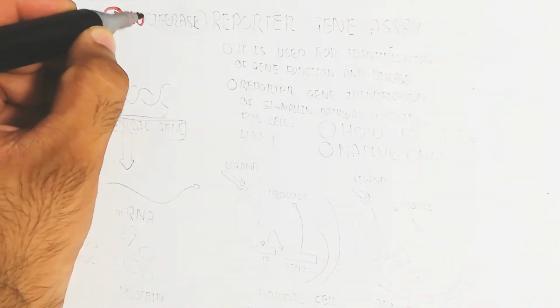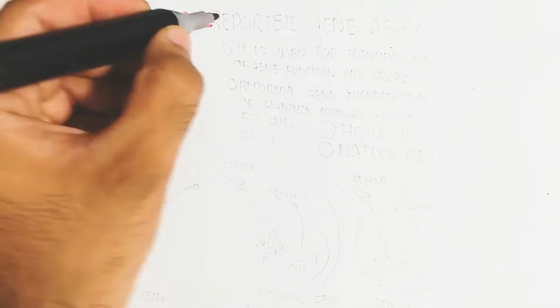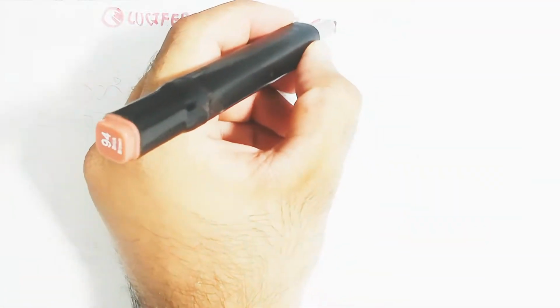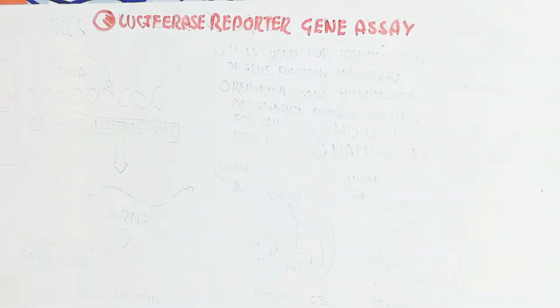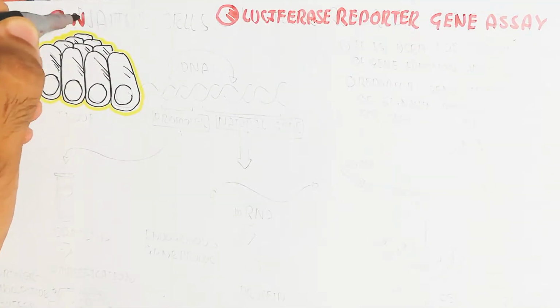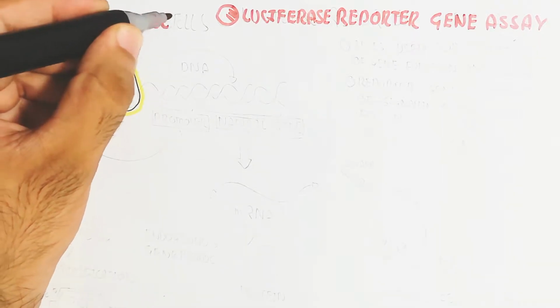Hello, in this video we will discuss the luciferase reporter gene assay. What is this? Let's begin to understand the whole process of the luciferase reporter gene assay and its application. It is used for identification of gene function and disease identification. So how is it possible?